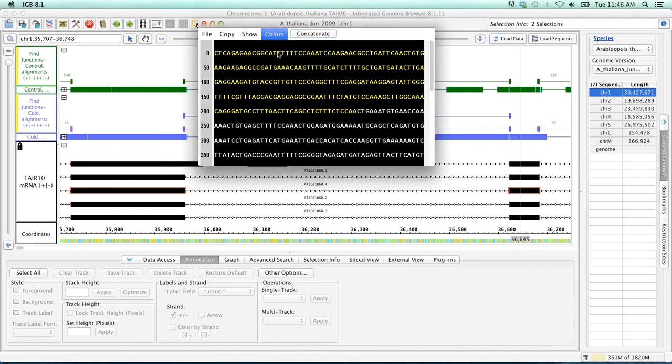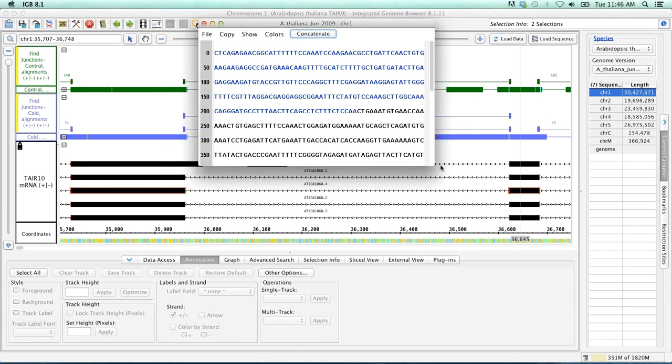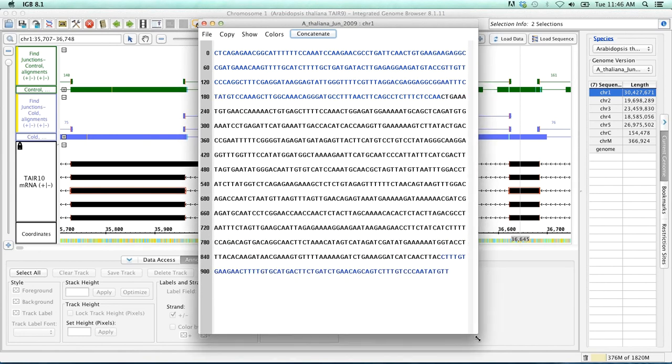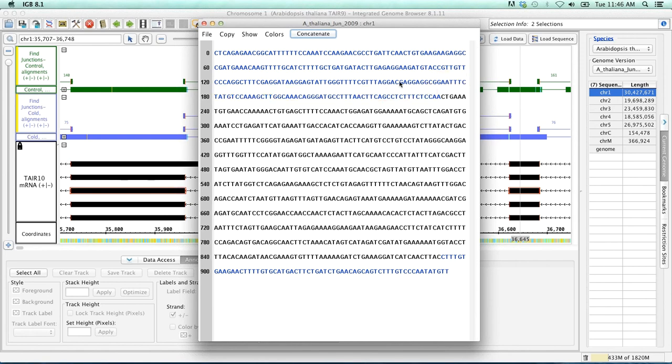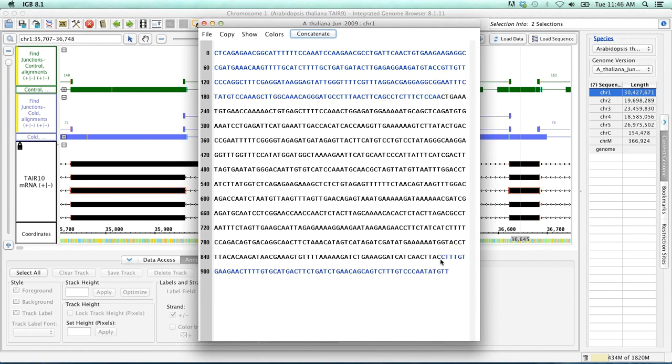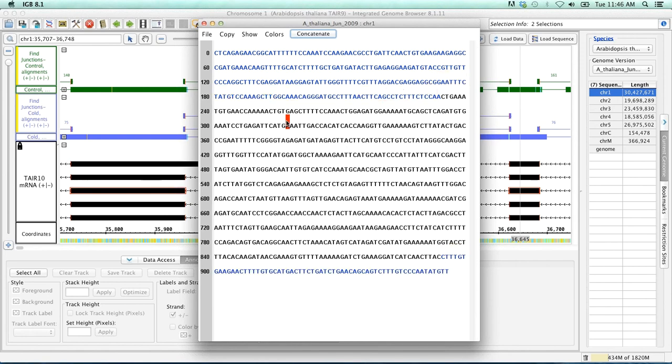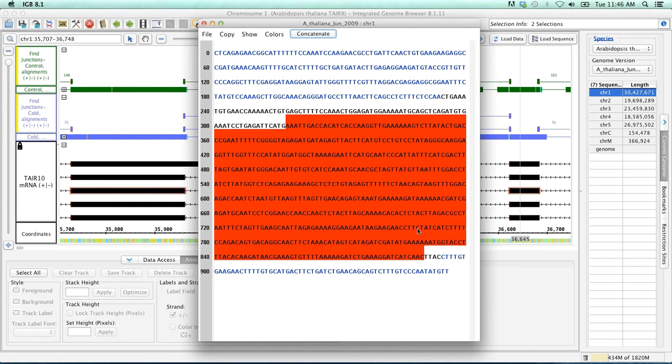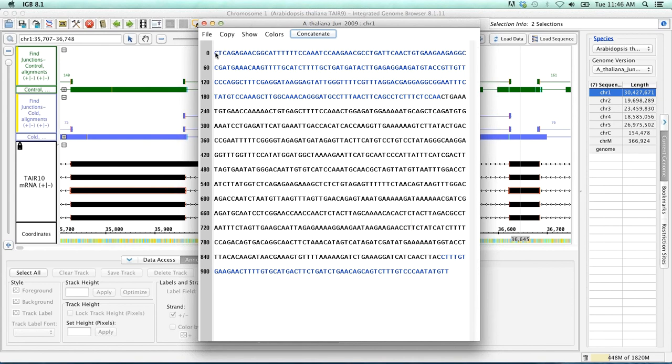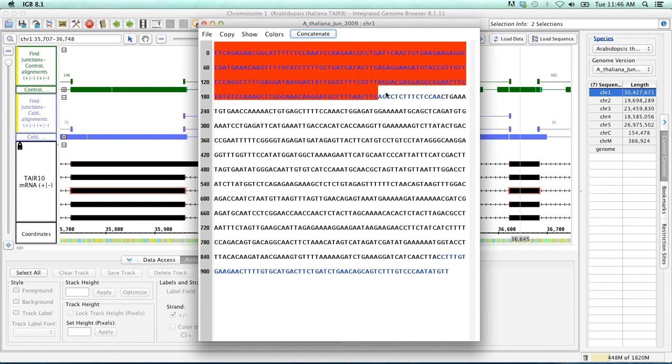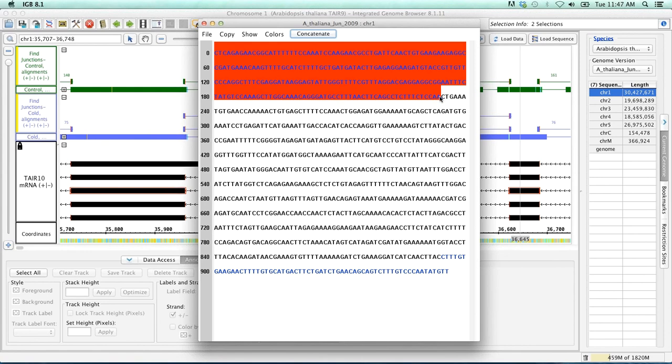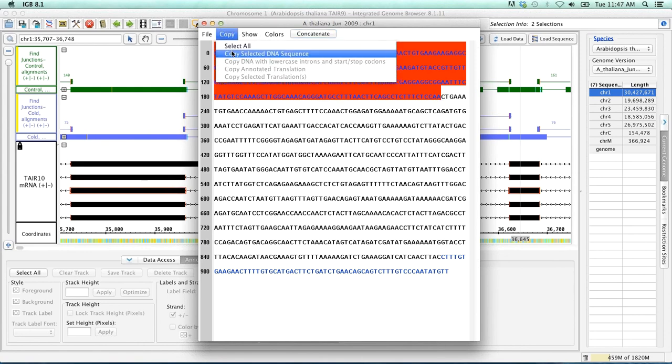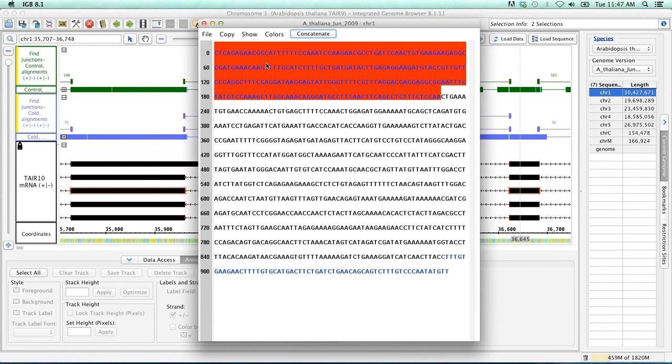Okay, now I'm just going to change the color really quick. So what we can see here, IGBE has highlighted in blue our two flanking exons with the intervening sequence here in black. And so in order to design primers around this, what we want to do is select this exon. I'm going to go to copy, copy selected DNA sequence.